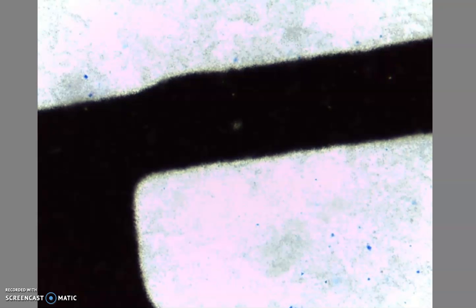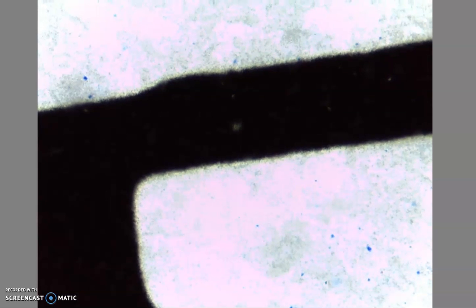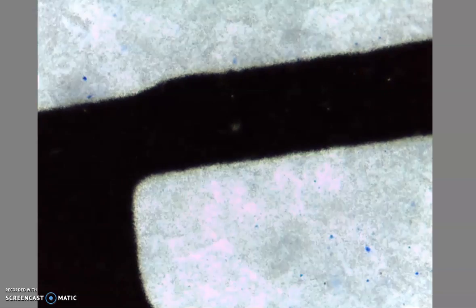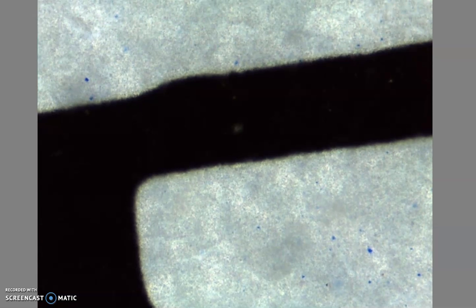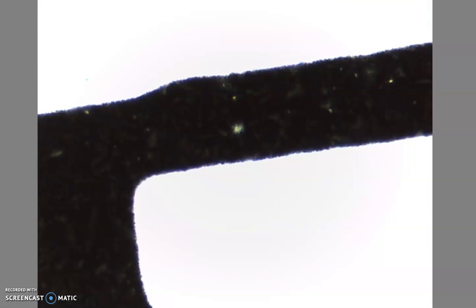The other thing, I think maybe it didn't come through quite as well in this program because this program adjusts for brightness automatically a little bit, is that as we zoom in, we also lose brightness. So the light on the microscope will decrease as we zoom in. So you can play with adjustment of the light, right? You can use the iris diaphragm, which is right under the stage, to make it darker or lighter, which I'm doing right now, even though the program is not letting me as well. It readjusts everything. That's kind of funny. On the microscope, you will not have auto adjustment. The computer is doing that for me.